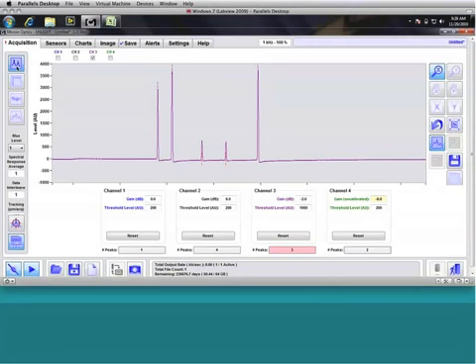And in that real-world application, there would really be 3 options that the user would have to rectify it. First, and probably the most unfortunate, is to just conclude that those sensors are no longer of adequate quality and that they're not going to be able to be included in the system. And so with the peak tracking on, basically the remainder of the sensors can continue on as they were. If it's just a reduction in the amplitude, then the user can either change the threshold level or adjust the gains, or a combination of the 2, in order to recover those sensors as part of their acquisition system.